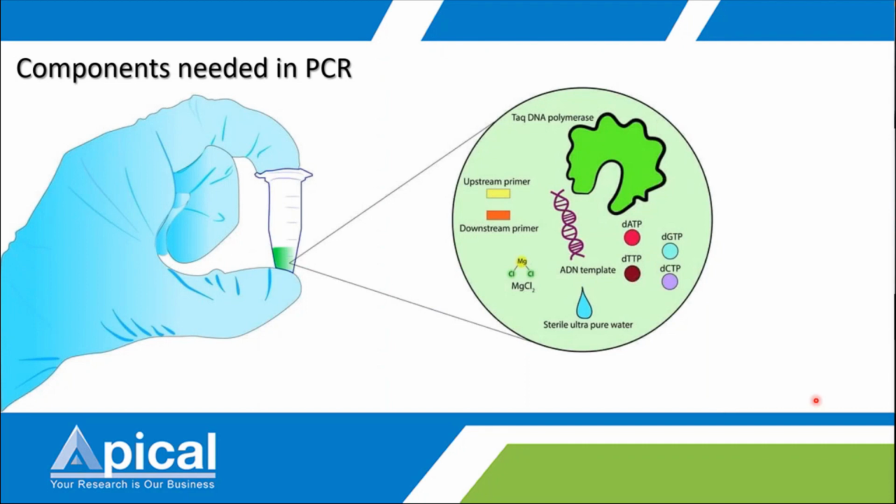And DNA polymerase in the PCR reaction will help in synthesizing the new DNA strand. So understanding the characteristics of this enzyme is very important, which will then tell you how we can develop DNA polymerase into a more advanced polymerase.